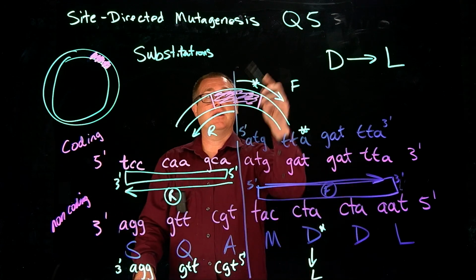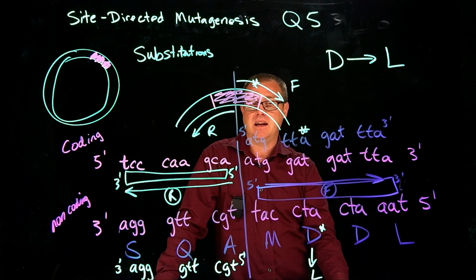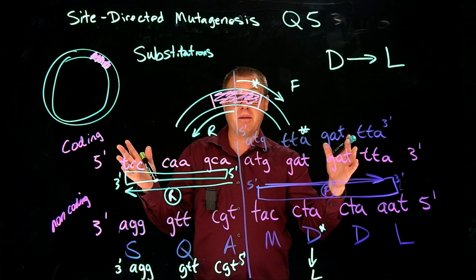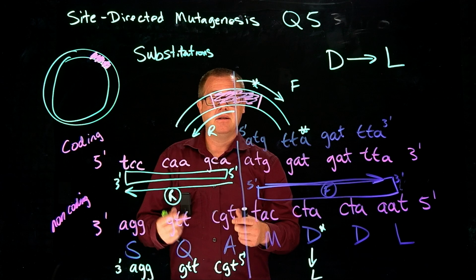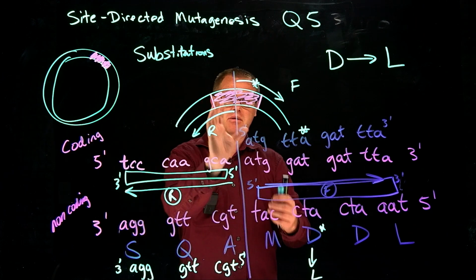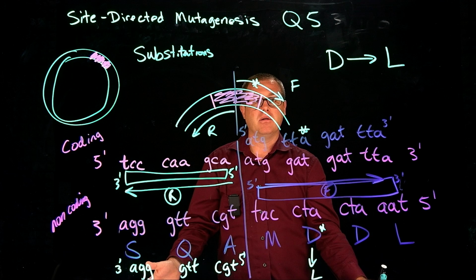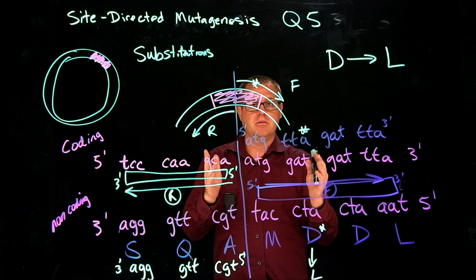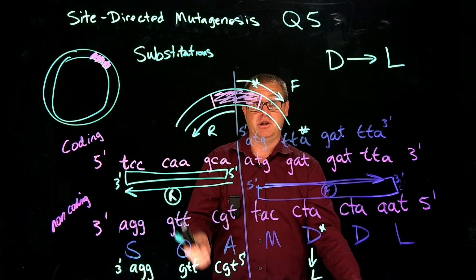But when you go to this website, they will talk to you about techniques about how big the primer should be. For the purposes of my class, I'm just more concerned that you could design a hypothetical primer that's small, because it's just assessing your understanding of what to do.